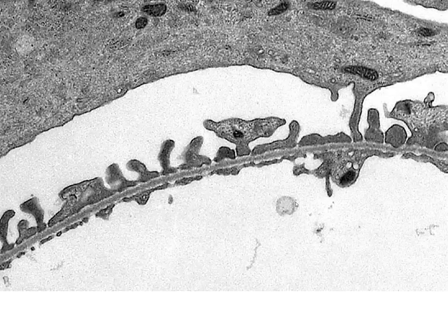Higher magnification, again, we've got our fenestrated endothelium. We can see our pedicels, and there's that nice view of the pedicel coming down. There you can see the slit between the pedicels, and that little line between is going to be our filtration membrane that's present within the slits. The light areas we see here are lamina rara interna and externa, and then lamina densa, the dark material, lining right down the middle.